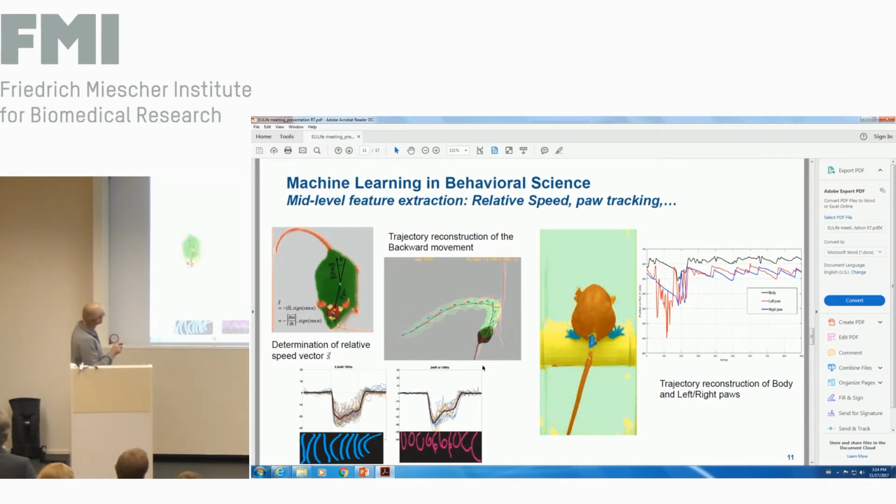And then you take the dot product between the displacement and the direction vector of your mouse, and when this cosine was positive, it means that the speed was negative. Then again, you reproduce all these measurements of the speed during the laser on periods, and you can assess different types of patterns in the trajectory, whether you are changing parameters of the laser, for instance, in this case.